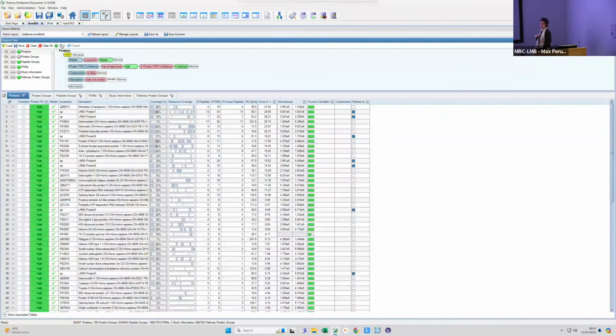And in some situations, it might be interesting to see what the abundance is between the different proteins. Generally, for gel band analysis, it's not necessary, but you can do it. We provide gel band analysis in two different softwares. Scaffold is usually the one that lets you see very straightforwardly: is it there? Is it not there?